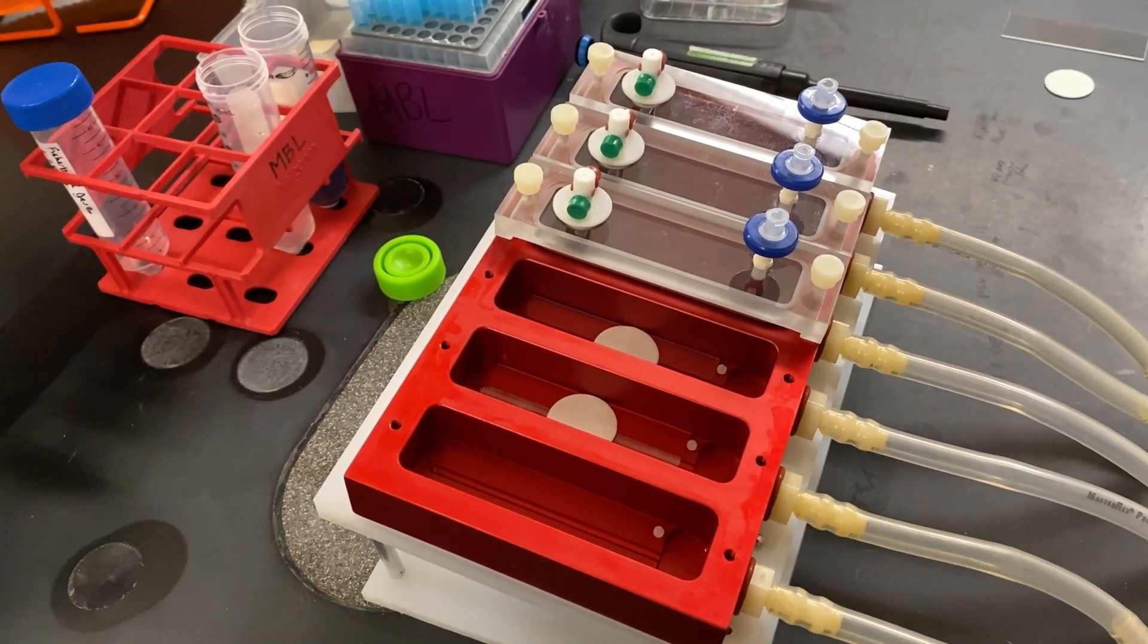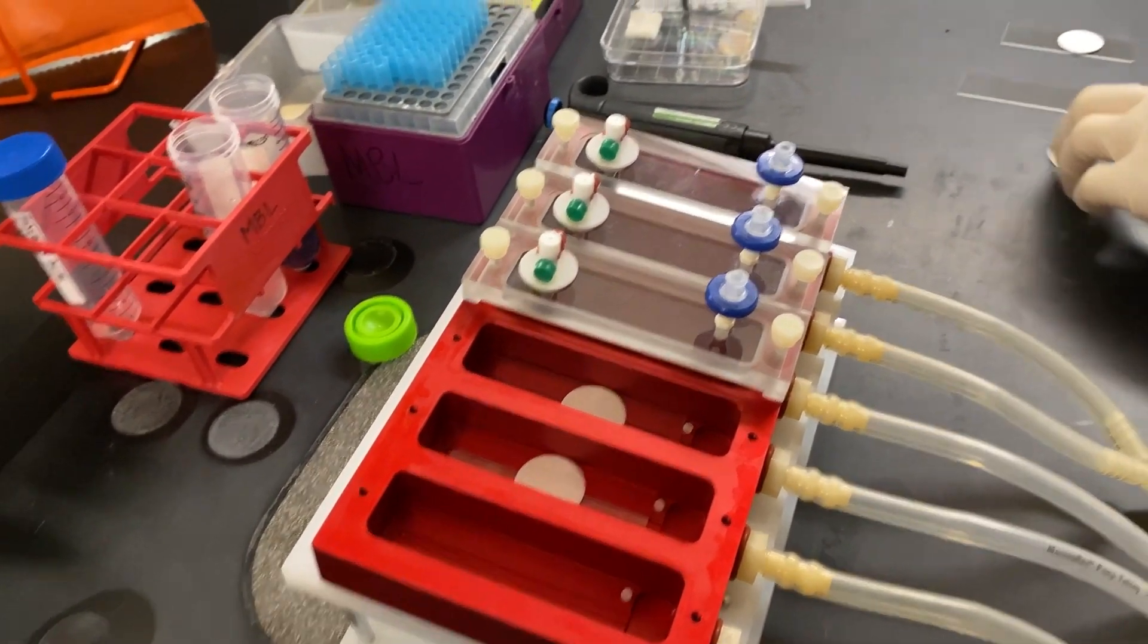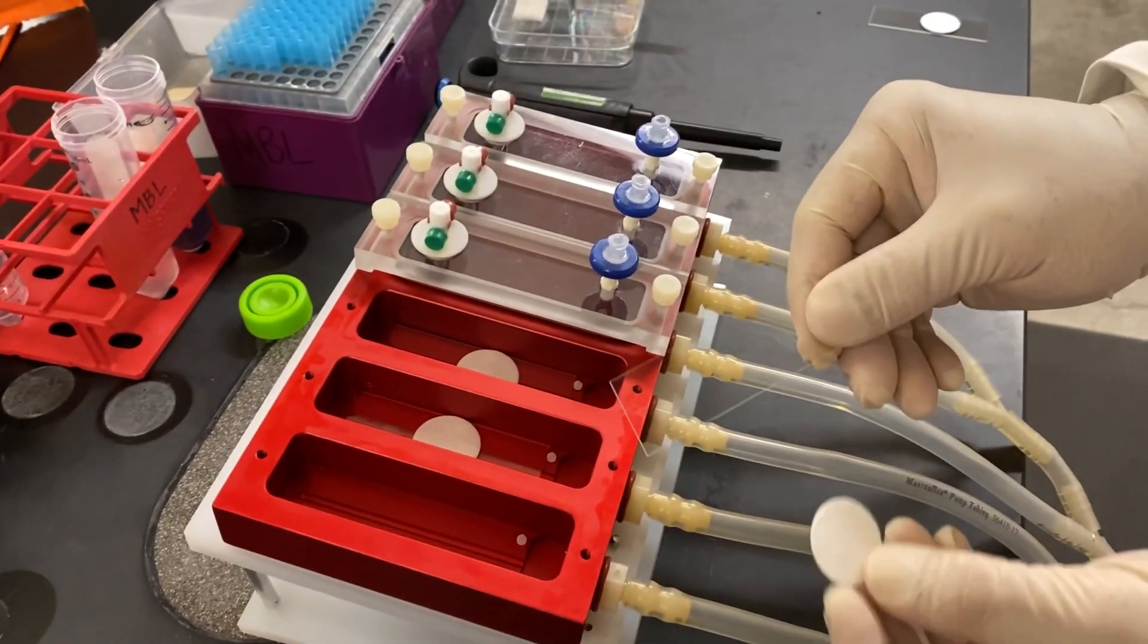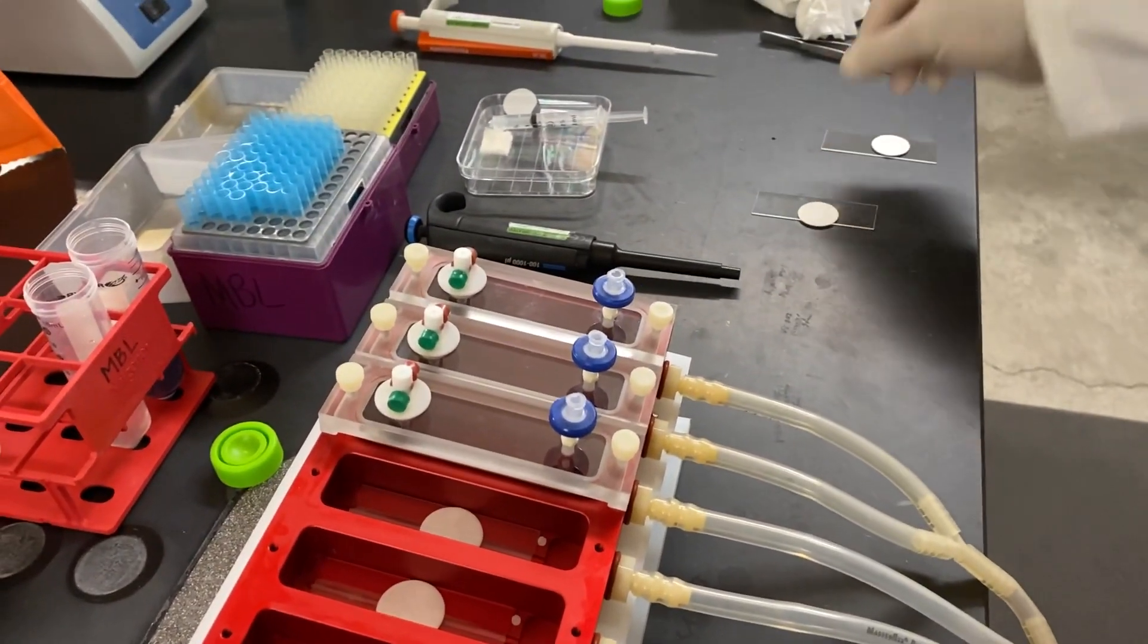First, we prep the reactor by gluing an absorbent pad to a glass slide, which is then placed in the reactor and autoclaved.